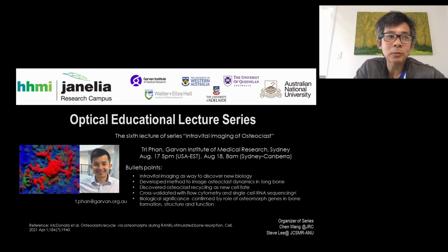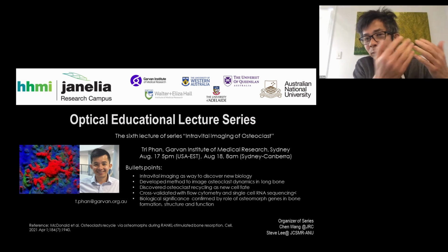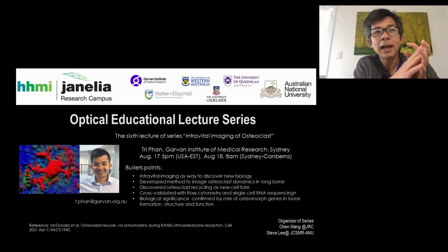Our original idea, working with the company, was to develop a two-photon solution, but we came into a lot of regulatory problems in terms of laser safety. So we ended up just using a confocal system, which was really suboptimal, because it was just autofluorescent contrast imaging. But definitely, there are not just optical but non-optical solutions for label-free imaging.